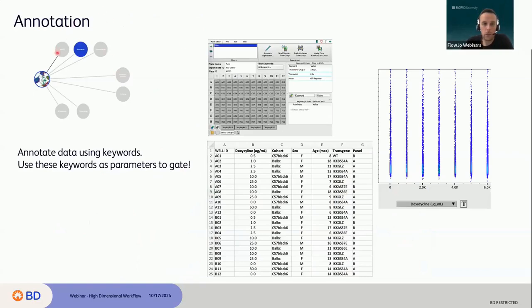All right, so we're done with the data QC steps. That's a big step here, so take your time on it. You need to make sure that your data is clean. It doesn't matter how good the algorithm you use afterward for dimensional reduction and clustering is. If you put junk in, you get junk at the end. So spend a lot of time there.